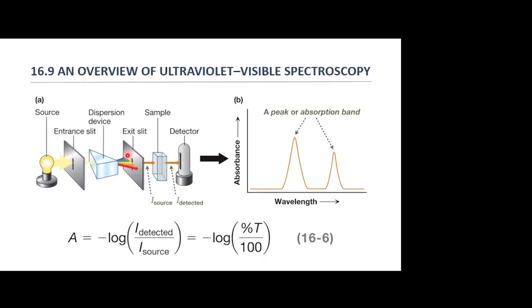All right, so if anybody's used a visible light instrument, did you use that in general chemistry? I don't know. It probably would have been the Vernier. You would have a little black box that you attach to those LabQuests, with a little cuvette. So that was a visible light system. You saw there's a little light bulb in there. You would have selected the frequencies that you wanted, and it would have actually selected that frequency using this little slit.